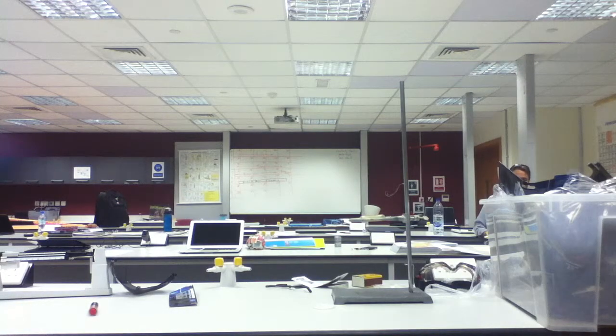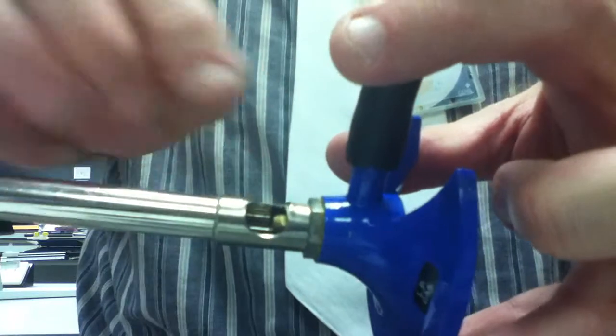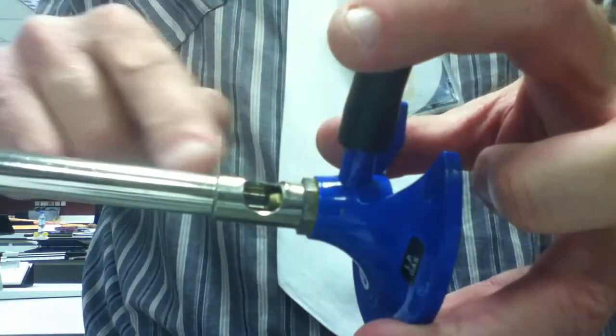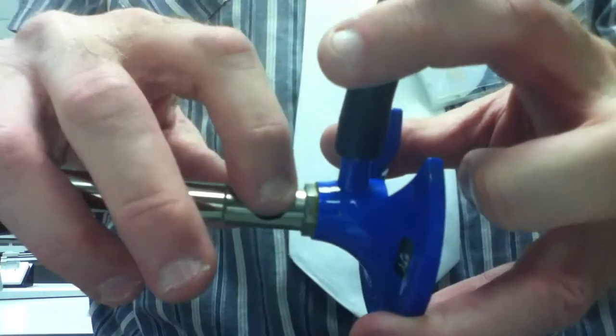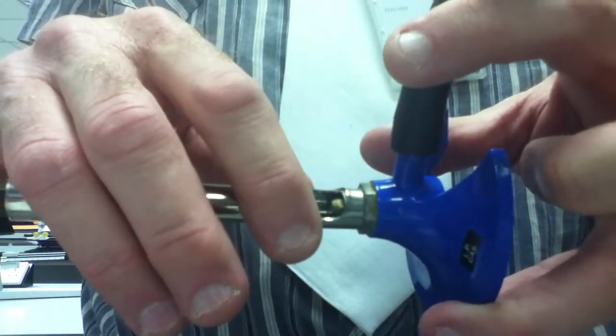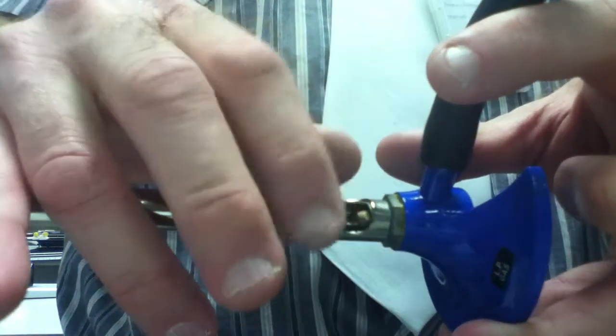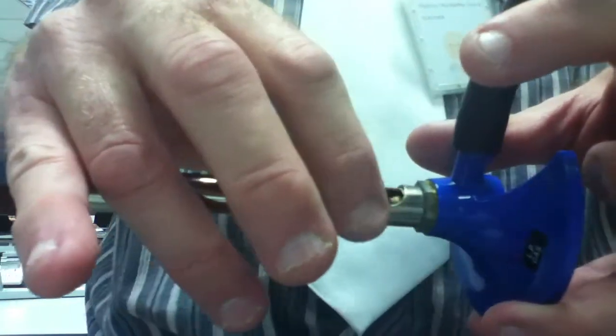Can you see that? See that little hole there? Well, the gas is coming this way and out the flame, and this allows the oxygen to mix. Now, if I have it open this much, what do you think is going to happen? It won't light. Yeah, that's right, because there'll be too much oxygen. You don't want that much oxygen, so you have to close it so that it's a perfect flame.